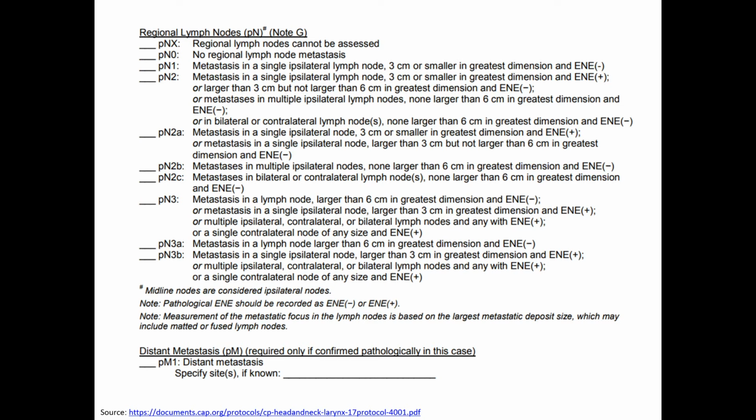If they don't do that, it is still very helpful to separate left and right lymph nodes if you identify them by chance. Most of the time, if the tumor's in the left, they're going to do a left dissection, and they might leave the right alone. It just depends how big the tumor is and whether they think it's crossing the midline or not. But it is still very helpful if you can differentiate that.